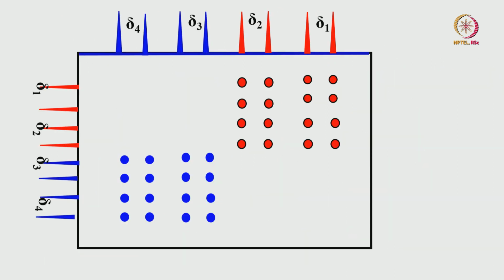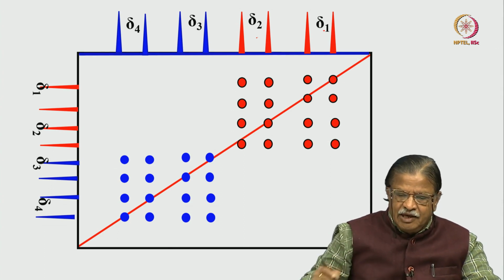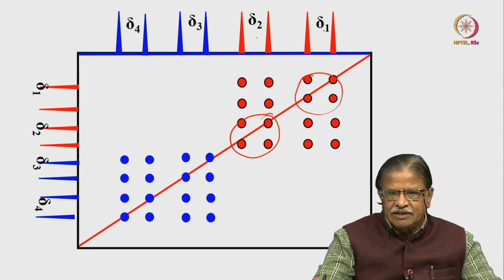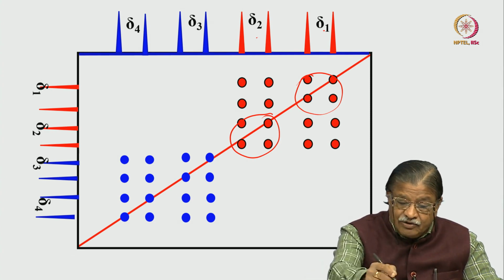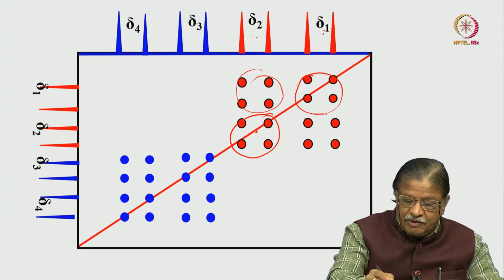Look at this one. If I take this mixture of molecules and run a COSY spectrum, and I get a pattern like this, this is the COSY spectrum and this is the diagonal, then I would say 1 and 2 are coupled. Why? These 2 are coming from one molecule, because, as I told you, this will give 4 peaks on the diagonal in a square pattern, in-phase doublets. Both 1 and 2 will give diagonal peaks, 4 peaks in-phase doublets. And since 1 is coupled to 2, there is a scalar coupling, so 1 will give a cross peak to 2 at this frequency, and 2, whose chemical shift is here, gives rise to a cross peak to 1.